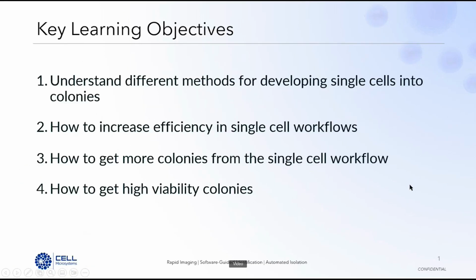From this webinar, we hope you're going to take away some key learning objectives. Firstly, we want you to understand the different methodologies that are available to you for developing single cells into colonies, how to increase the efficiency of your single cell workflows, how to get more colonies from these workflows, but most importantly, how to get high viability cells that are exactly the phenotype that you need to advance your research.